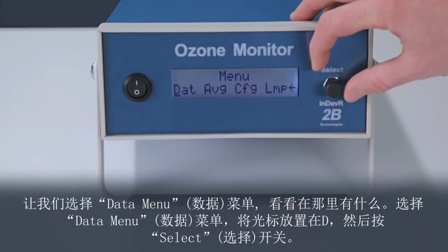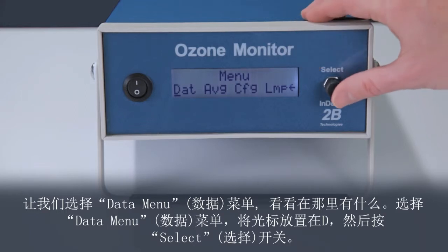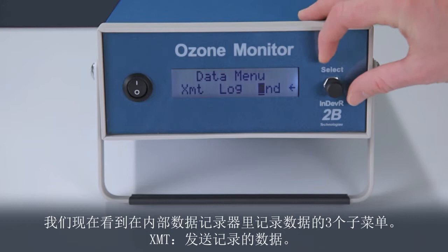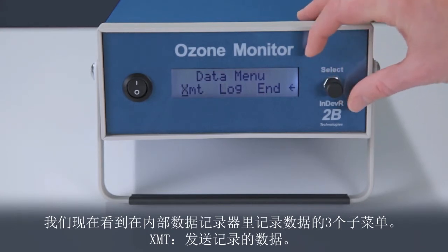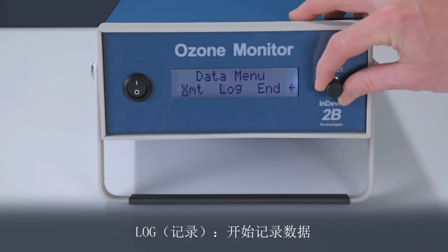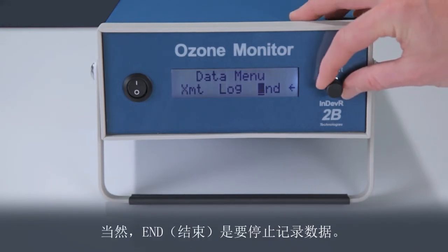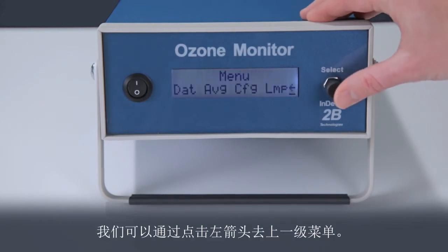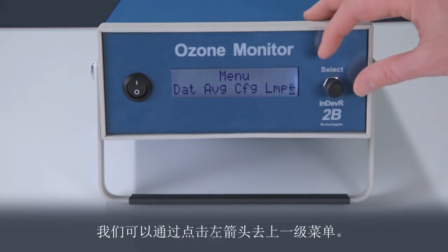Let's select the data menu and see what's there. To select the data menu, place the cursor over the D in DAT and press the select switch. We now see the three submenus for logging data in the internal data logger: XMT is for transmitting log data, LOG is to start logging data, and END is to stop logging the data. We can click on the left arrow to go one level up in the menu.